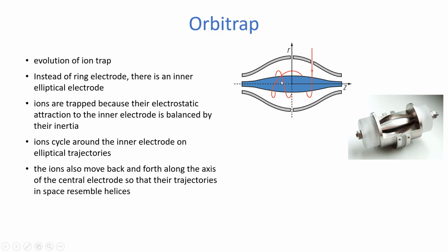You can collect them and basically trap more and more ions of the same mass to charge ratio and build up a pretty decent signal. So in a way, Orbitraps are very sensitive because you can just trap more and more ions that you want, and it's very elegant and sensitive.